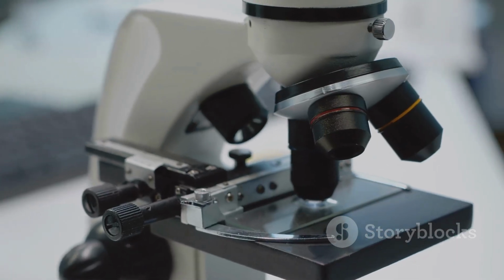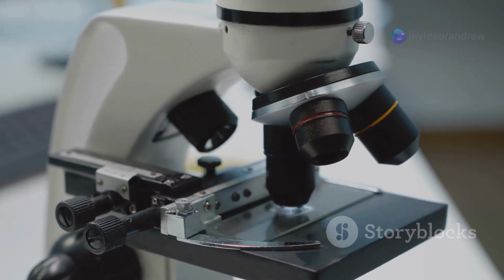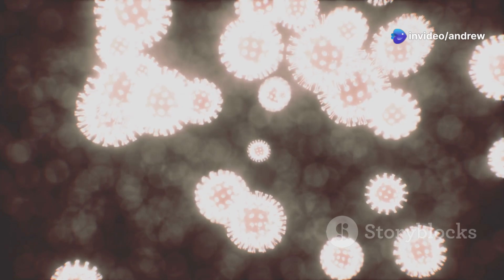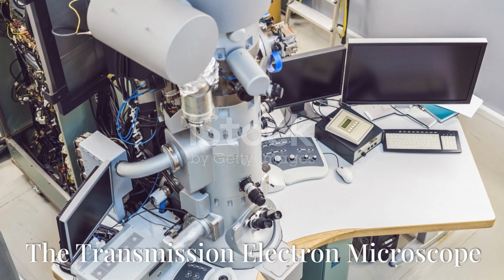Electron microscopes have revolutionized our understanding of the world. They have allowed us to see things that were once thought to be impossible to see, such as viruses, atoms, and even the structure of DNA.